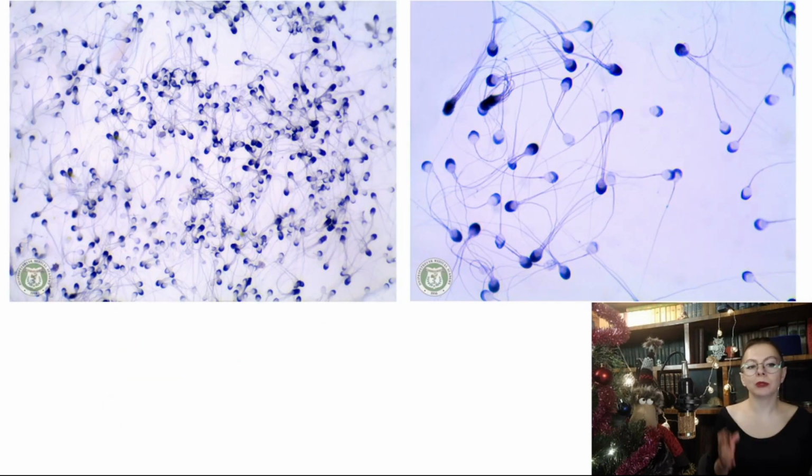First of all, I put specimens that are very distinctive, so it is very difficult to confuse them with others. Okay, spermatozoa. I think they are very unique, and you can distinguish them because they are stained with iron hematoxylin, shades of gray, and they have tails and a head with an acrosome. Difficult to confuse.